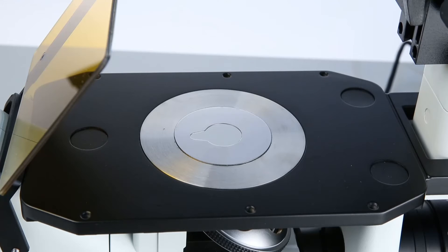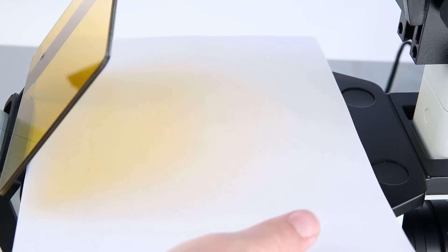You can use any stage plate as long as light can pass through. Then you'll place a piece of blank white paper on top of the stage. This in essence becomes our projector screen.